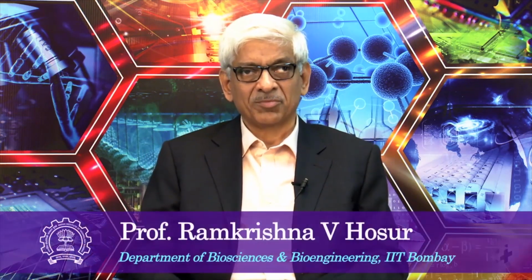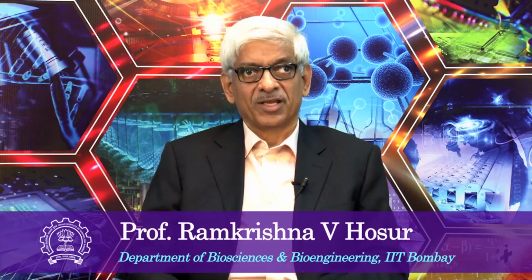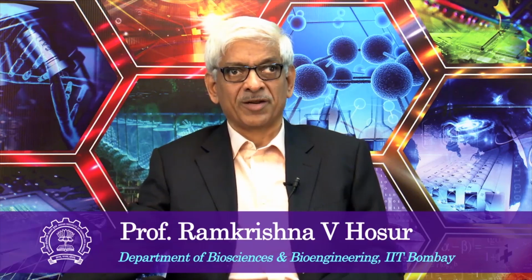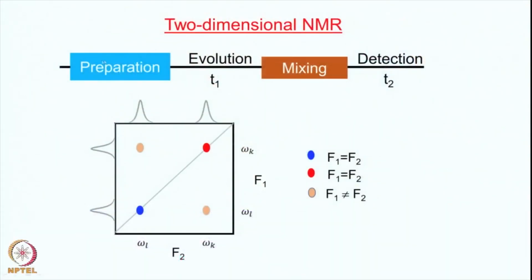So, let us do a recap of the last lecture, and this is the slide which summarizes what we did in the last lecture. This is 2-dimensional NMR, and this is based on the concept of segmentation of the time axis, and the time axis is separated into 4 periods like this.